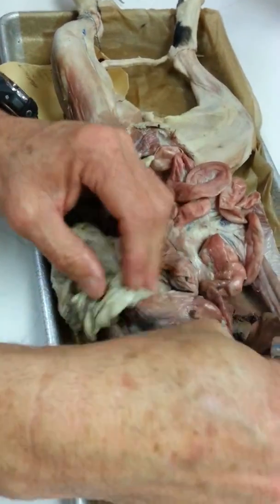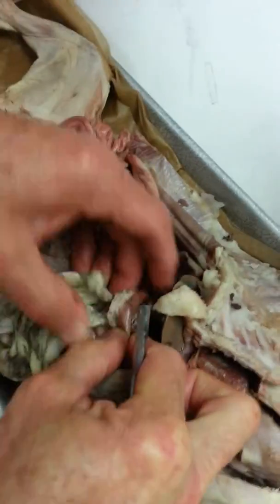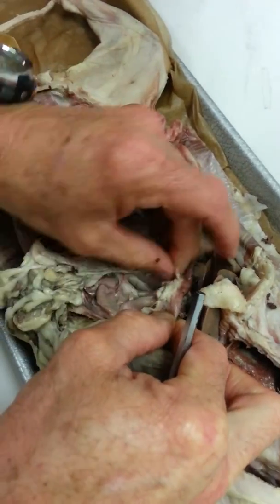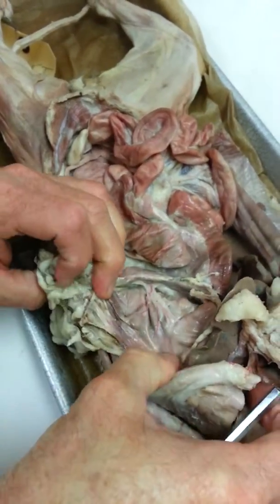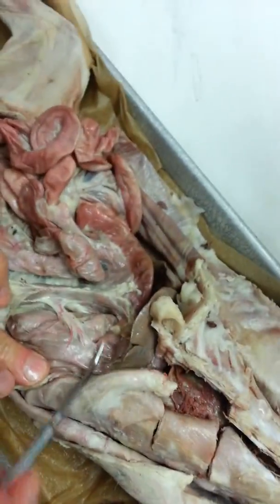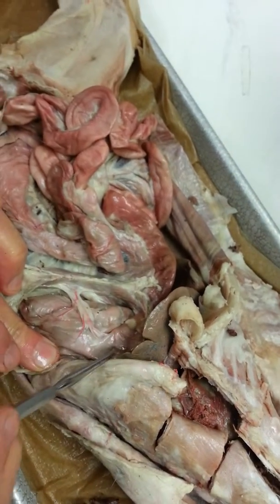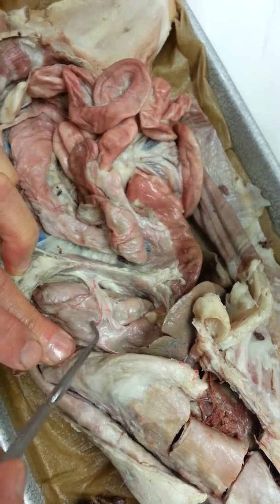And then this structure right here is the stomach. Let's pull some of this greater omentum off of it. This big structure right here is your stomach. This whole thing right here. And let's see if we can pull this apart a little bit. So the stomach right here, the upper third on this area right here is the fundus. Up here is the fundus of the stomach. This is the body of the stomach right in here.